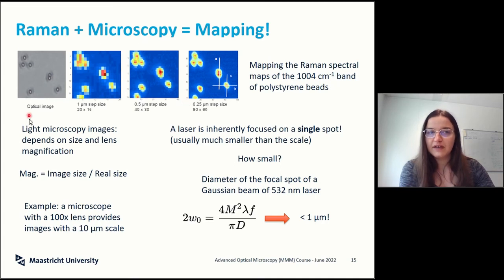So here you can image the whole thing, so you can reproduce the image, but the only thing you have to be mindful of is that if this thing was taken at a bigger scale in light, the light is fine, the light can still focus, but to focus a laser you need to stay on a single spot.